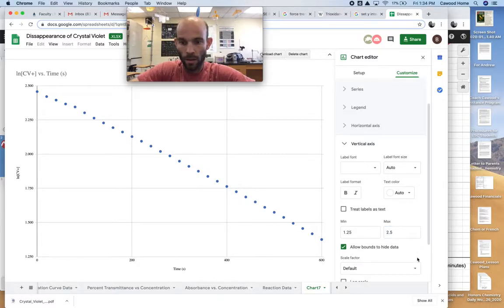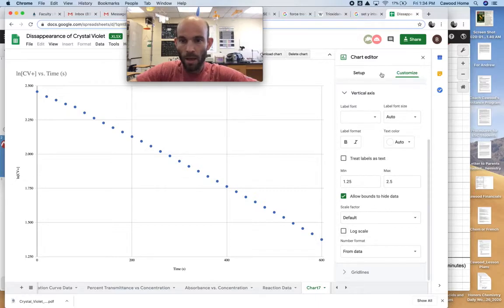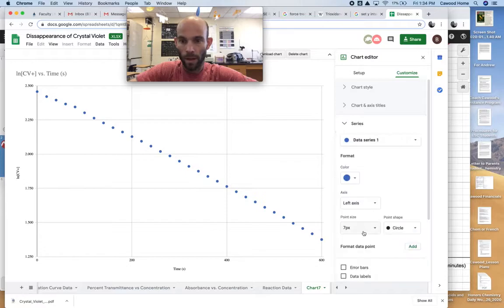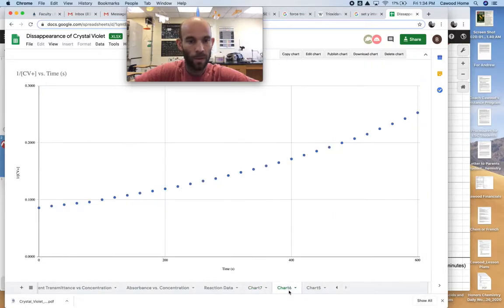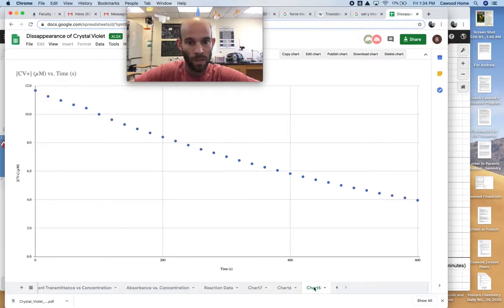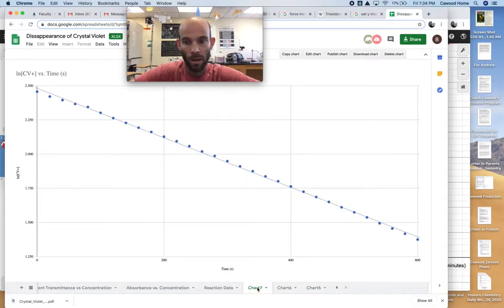And let's put a line on that and see how it looks. And there we can see that that's looking quite linear. Okay, it's not perfect, but it's much more linear than our other graphs are. That's clearly an upward sloping curve, and this was a downward sloping curve. And so here we've got a nice linear type of relationship.